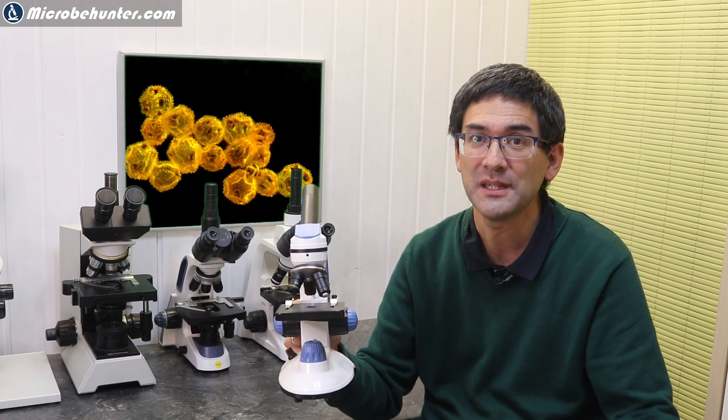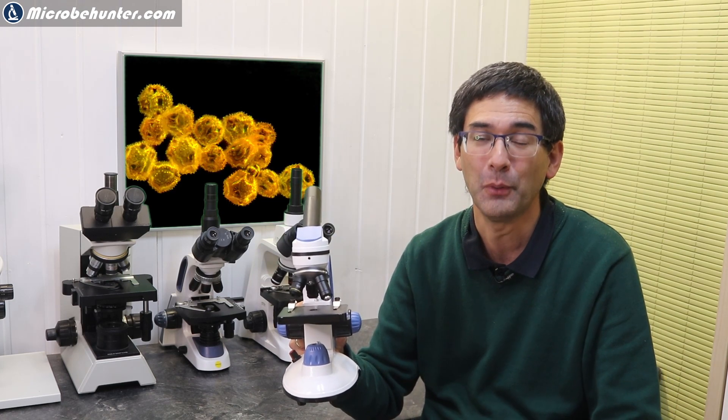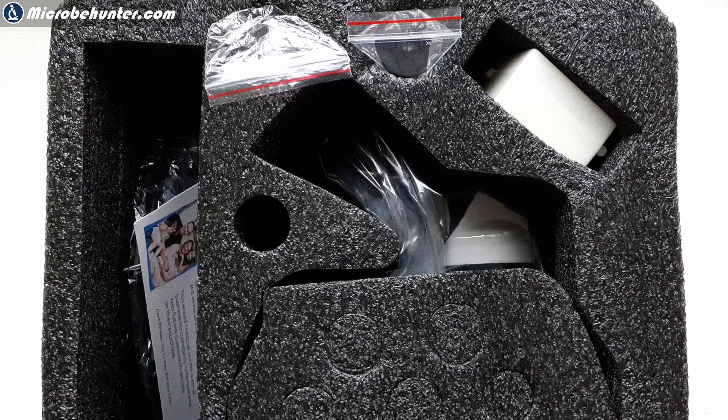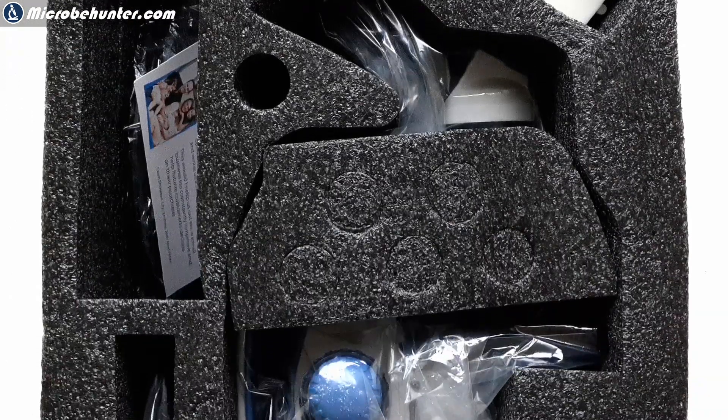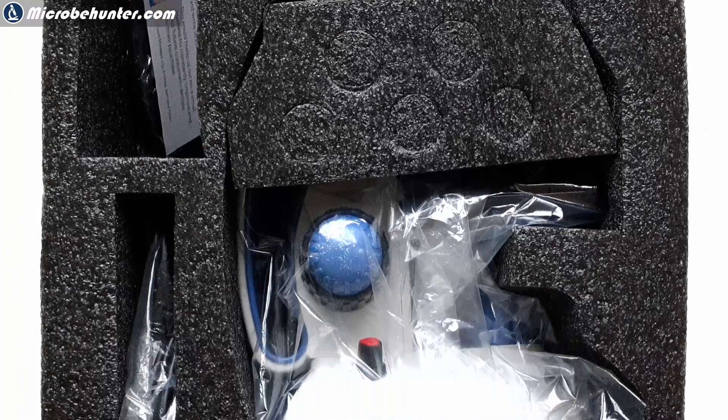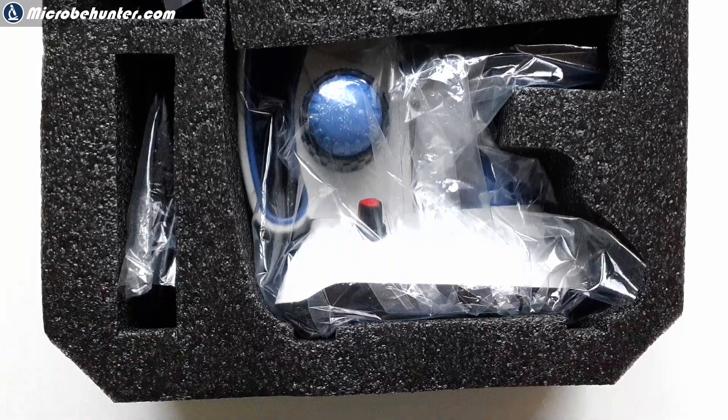So what we're going to do now is I'm going to simply start unpacking the box and we're going to have a closer look at what you get. So let's start to unpack the microscope. This is what you get in the box. It's all packaged in foam.